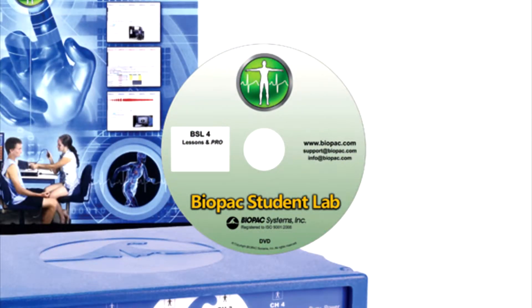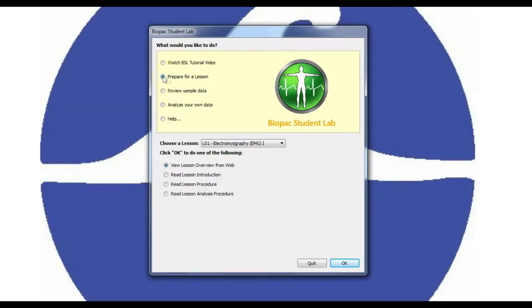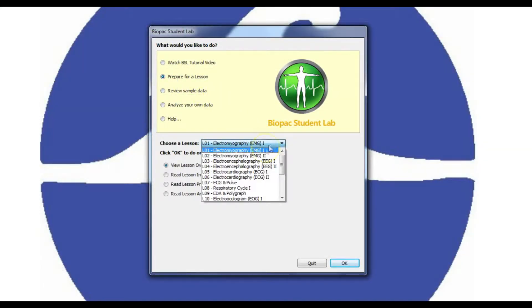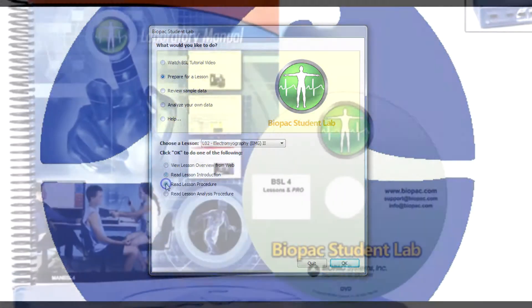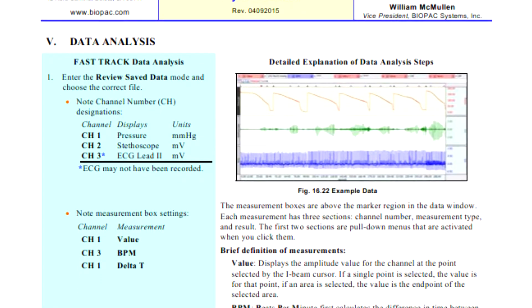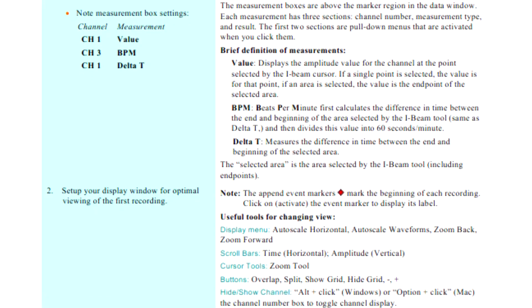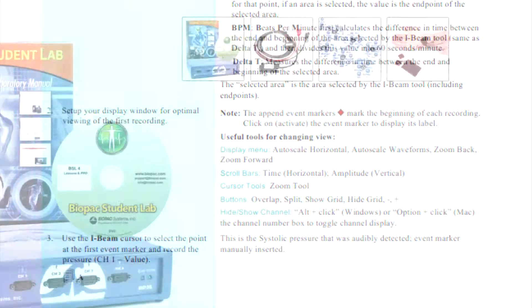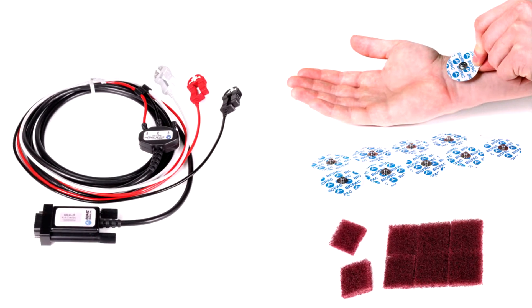The Biopac Student Lab software is included for data recording, analysis, and sharing. Students can use the free student download to prepare and analyze data outside of class so more recording can be done in lab. The BSL lab manual provides detailed lesson introductions, procedures, and analysis procedures written in conjunction with esteemed professor emeritus Richard Flanzer. Also included is an electrode lead set with disposable electrodes and electrode accessories.